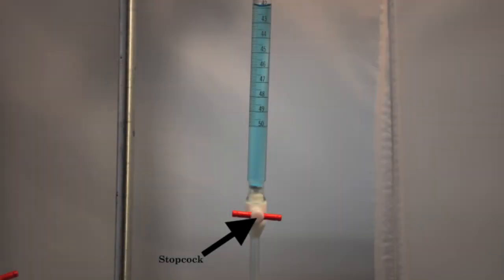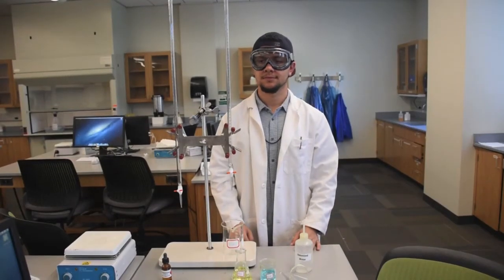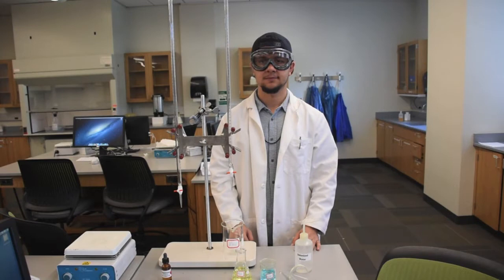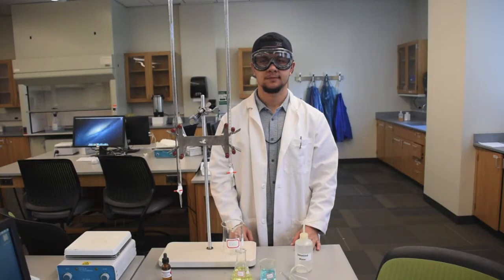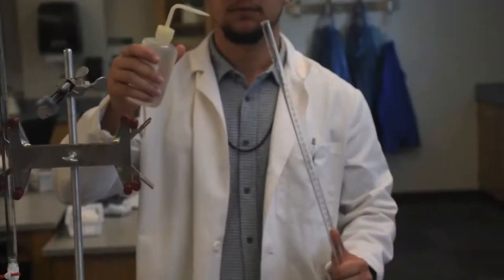Burettes are typically used in titration experiments. This is where a solution with a known concentration is used to determine the concentration of another compound. In order to properly use a burette, proper rinsing and washing must be done to ensure there are no molecules or particles that could potentially interfere with what is being measured. Washing is essential. Never assume your glassware is clean.